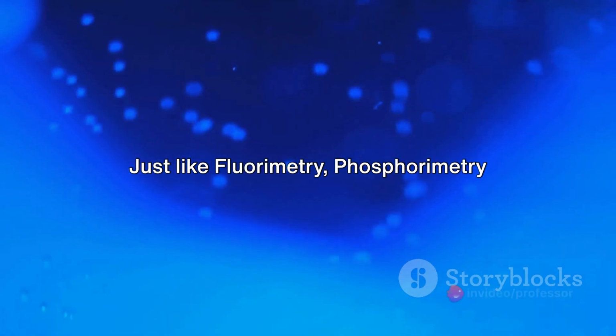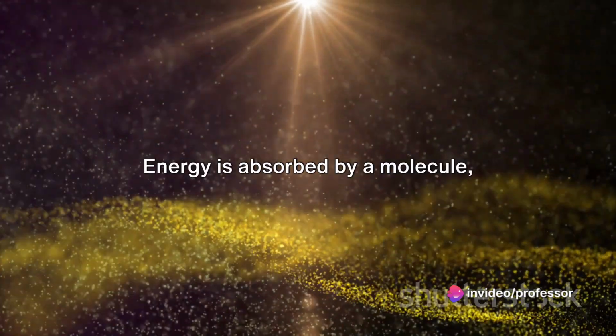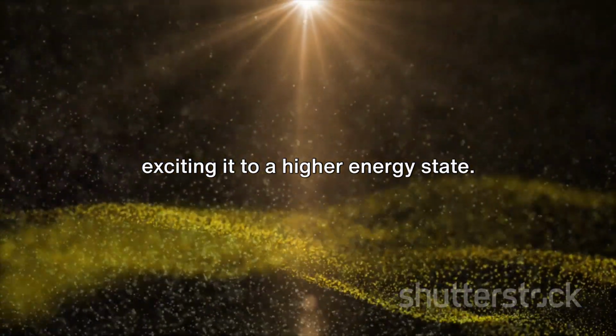Just like fluorimetry, phosphorimetry also works on the principle of excitation and emission. Energy is absorbed by a molecule, exciting it to a higher energy state.